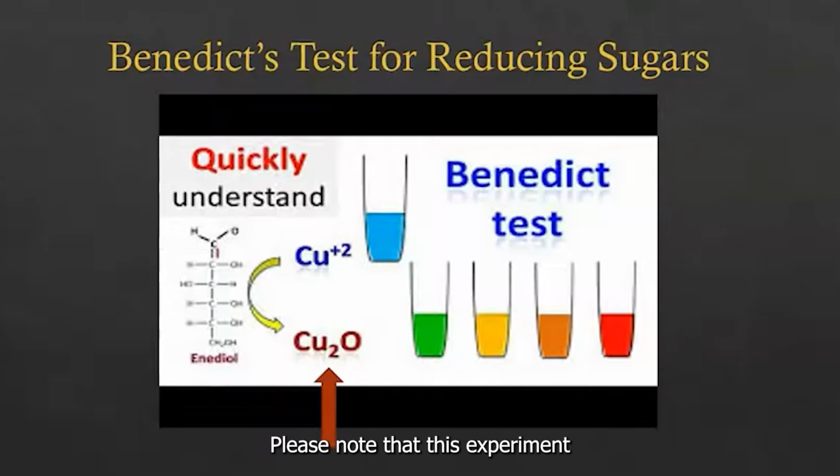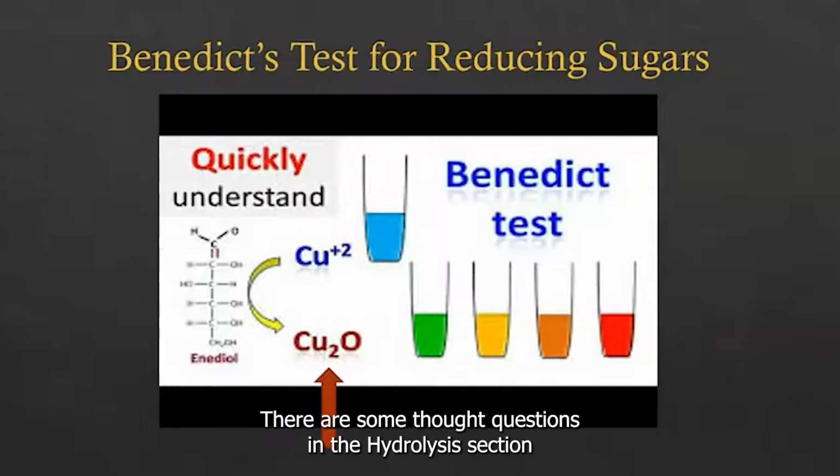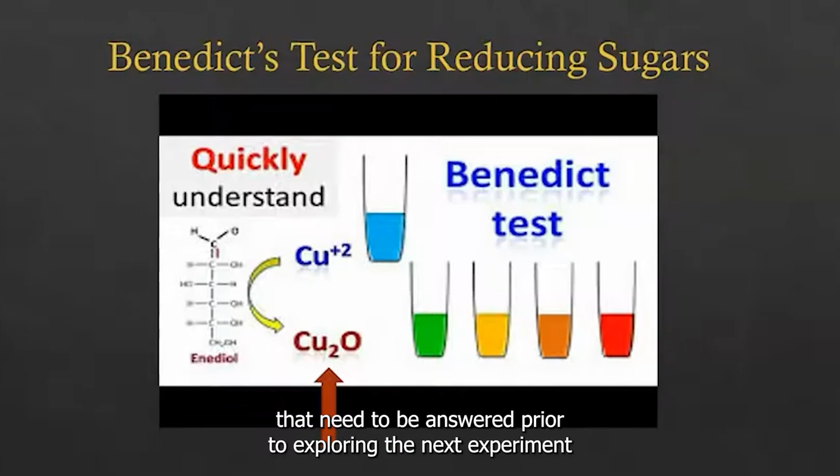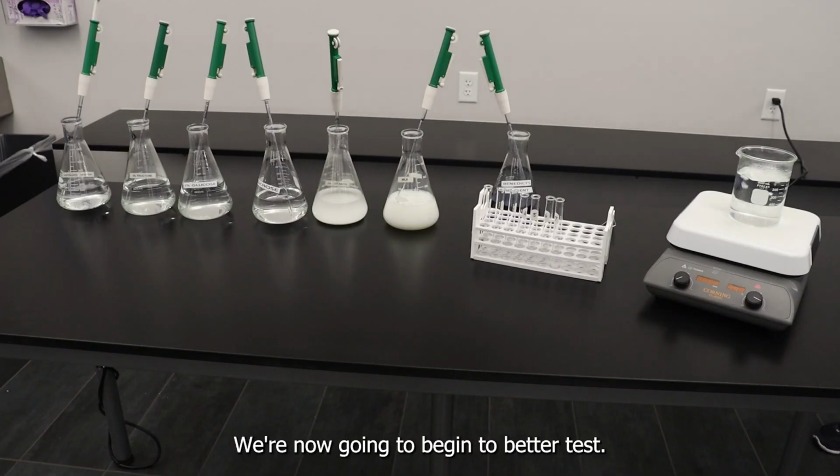Please note that this experiment should be immediately followed by the hydrolysis experiment. There are some thought questions in the hydrolysis section that need to be answered prior to exploring the next experiment. We're now going to begin the Benedict's test.